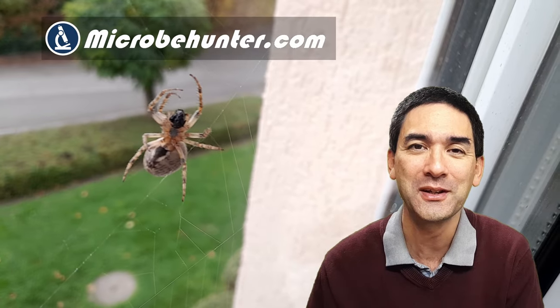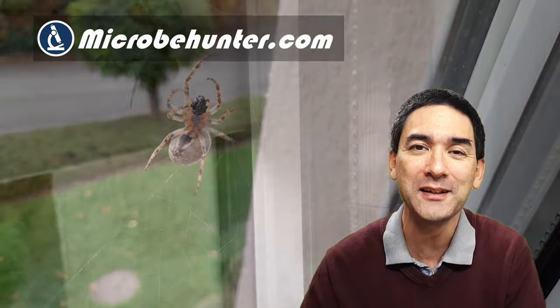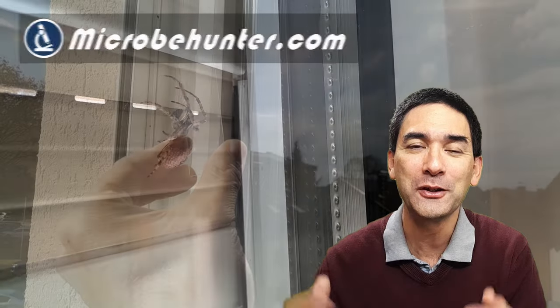I know this is pretty fancy. Hello and welcome, Microbe Hunter here and let me introduce the spider to you which donated its web to me rather involuntarily.